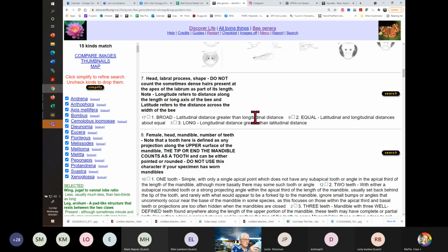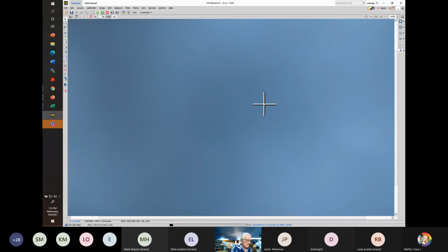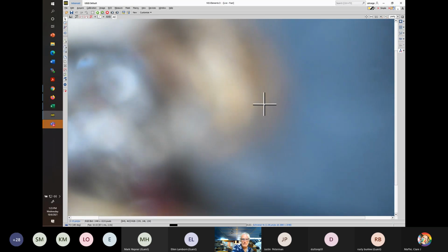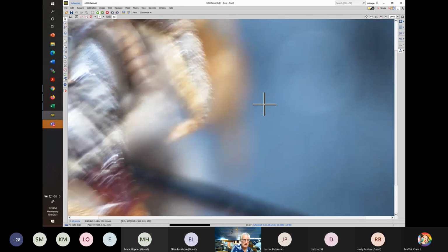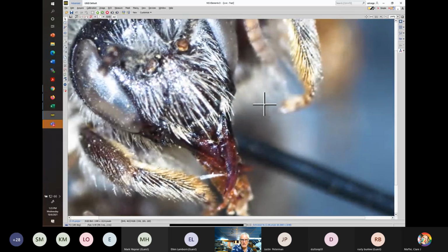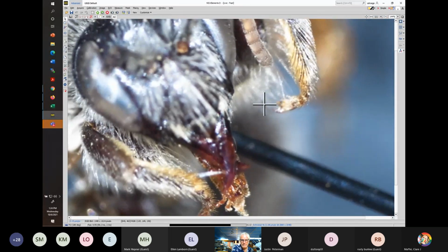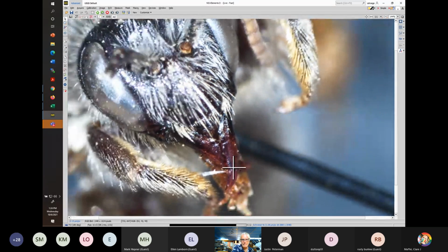But the problem often, although this has very long mandibles, is that we can't see that labral process because the mandibles are in the way. They fold it over the labrum, so you can't look at the ratio if it's happened. A lot of people will snap the mandibles out when fresh, but in this case, they can't really see what's going on very clearly because even though the mandibles are long, they still are covering the labrum, which is right there, pretty handily, so not useful.